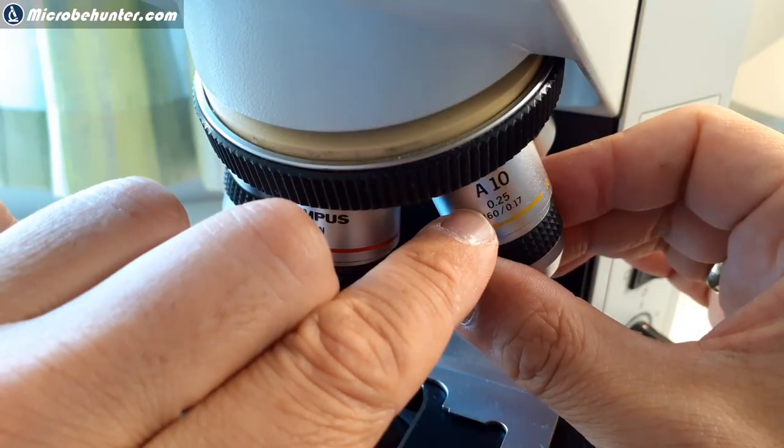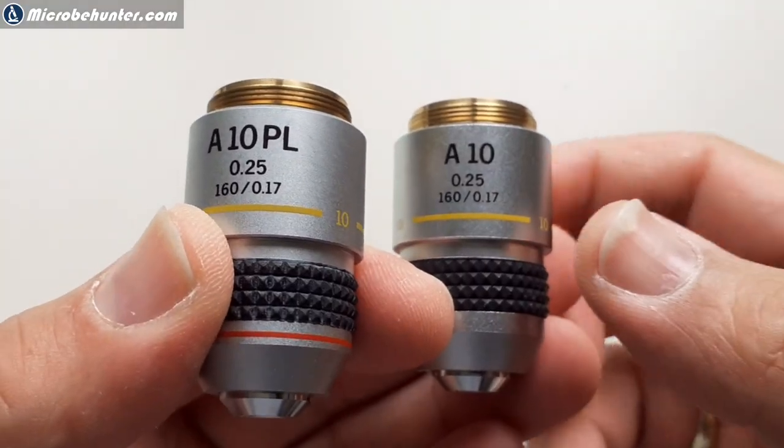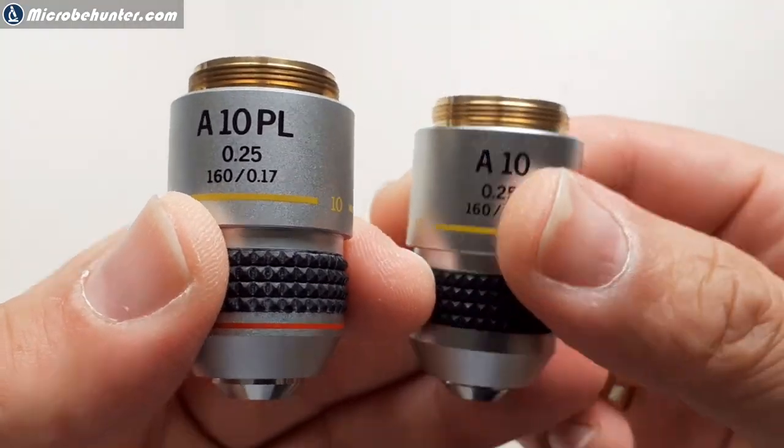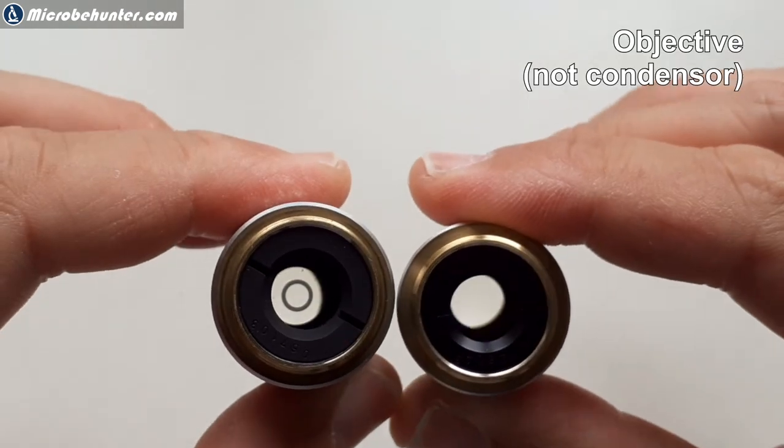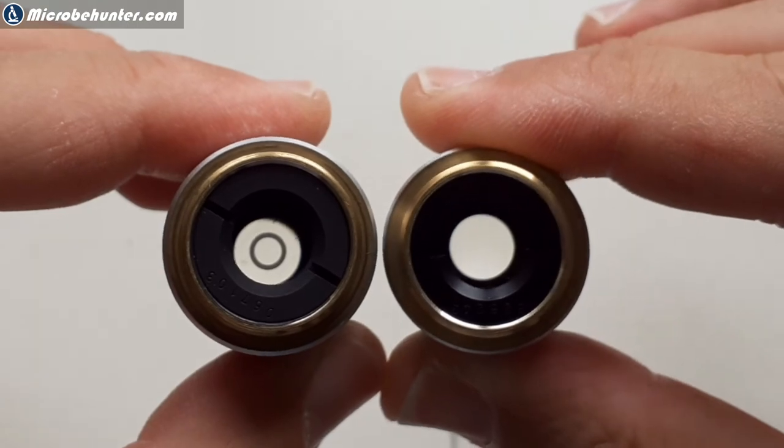This one is my regular bright field objective, achromatic 10 times. I'm now removing it. Next to it on the left side is the phase contrast condenser, and you can see now the phase ring. This phase ring is absolutely essential for phase contrast.